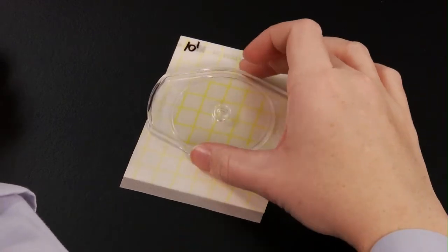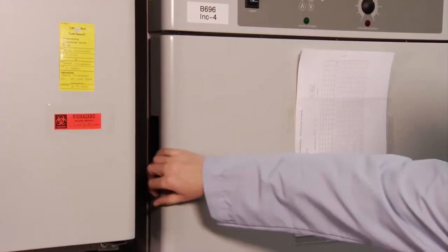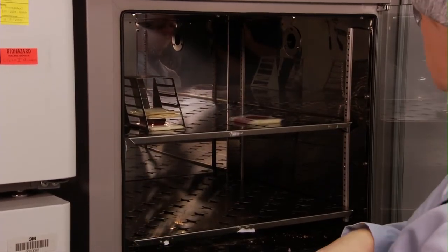Lift the spreader and allow 1 minute for the gel to form. Now, let's talk about incubation. Incubate 3M PetriFilm aerobic count plates with the clear film side up, in stacks of up to 20.